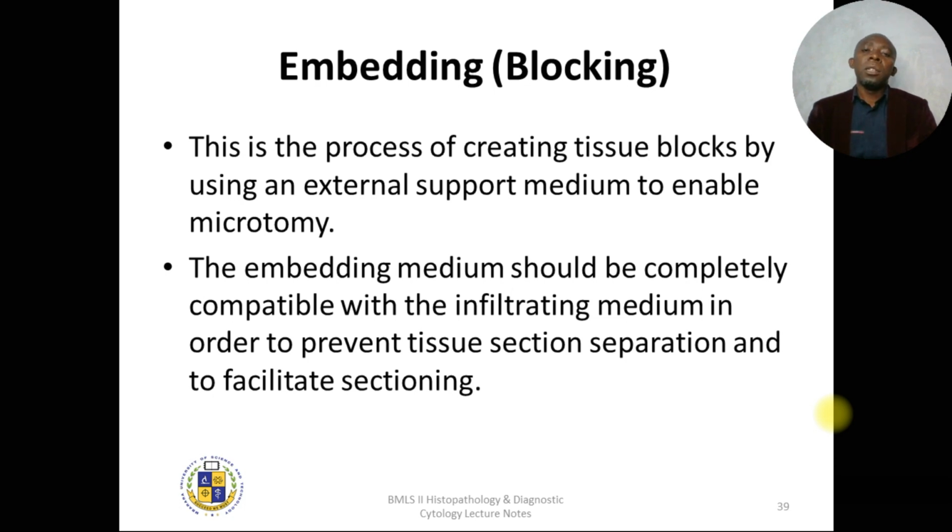The embedding medium should be completely compatible with the infiltrating medium in order to prevent tissue section separation and to facilitate sectioning. I mentioned this before, that when you're making a choice of the infiltrating medium, you must also consider the embedding medium. So these must all be the same so that there is uniformity and they do not cause separation and make layers in the sections.